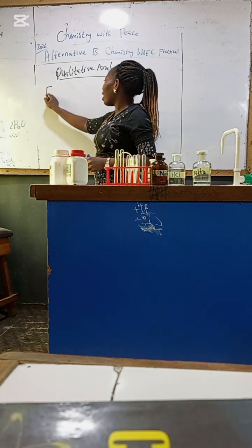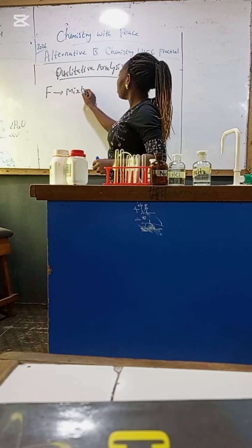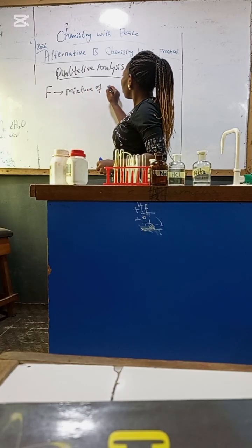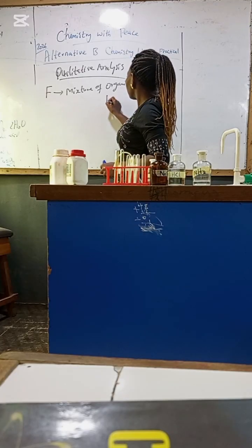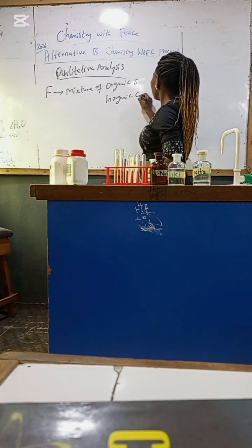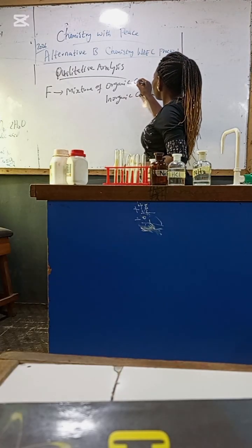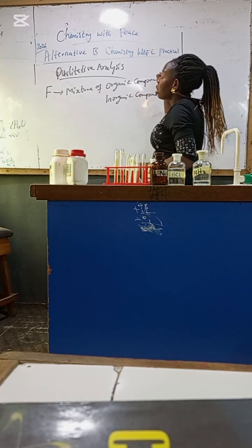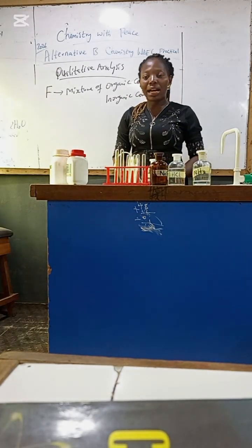We have sample F as a mixture of organic and inorganic compound.